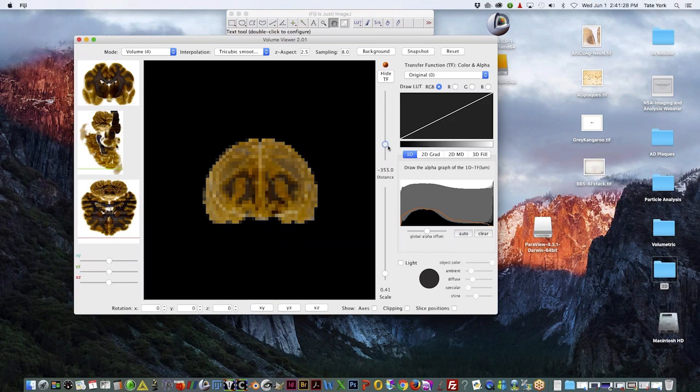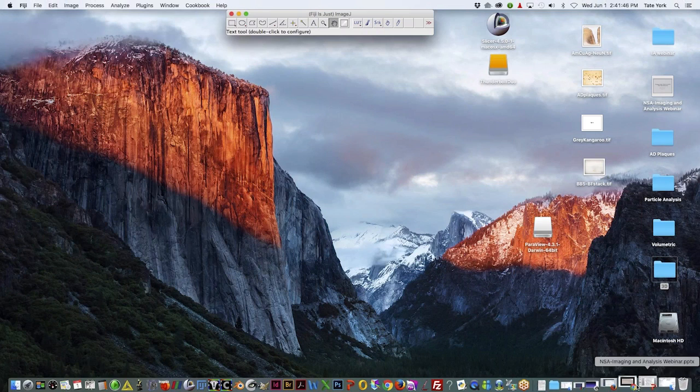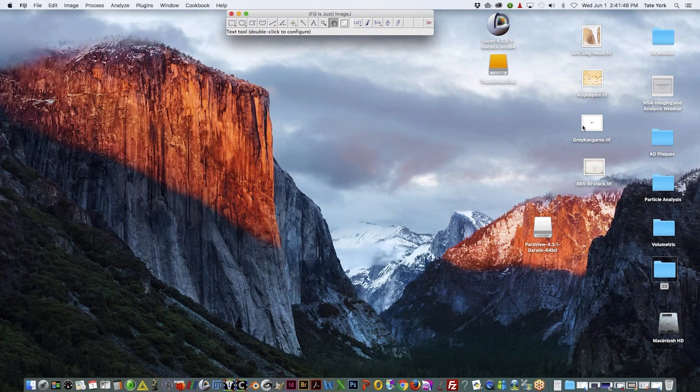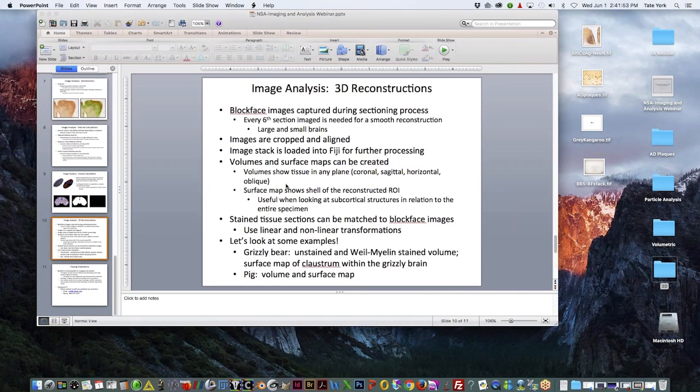And I've also included thionin sections in here, but I went ahead and added a Gaussian blur to the stack, so it will be more smooth for the reconstruction. As I go through here, you can probably catch a few glimpses of the blue staining, especially back towards the end when cerebellum comes into view. So you can kind of make out a little blue tincture here. And again, back here in cerebellum.